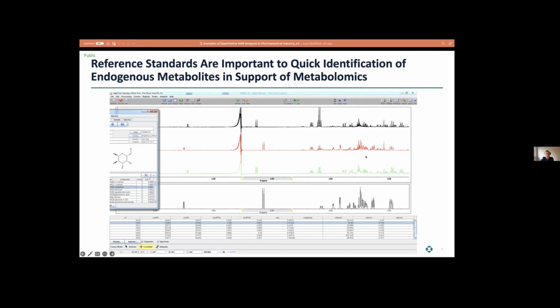Essentially, we can use software to query all the chemical structures based on NMR peaks, as illustrated here, and we can call up the library to match the peaks on the NMR spectrum. That really saves time and gives us the chance to query the biological question rather than solve individual chemical structures.